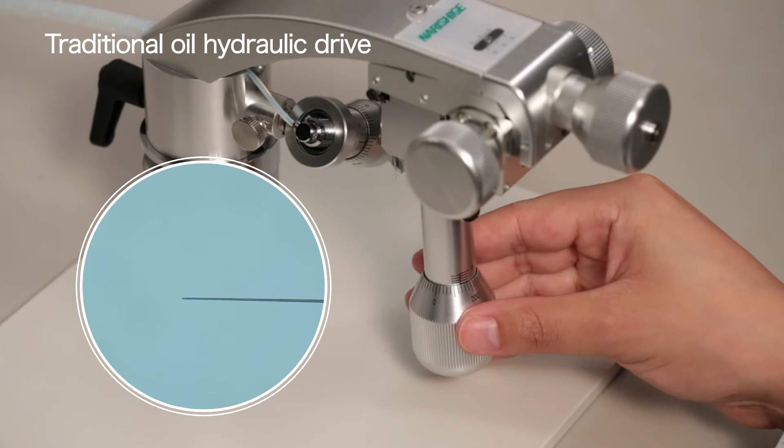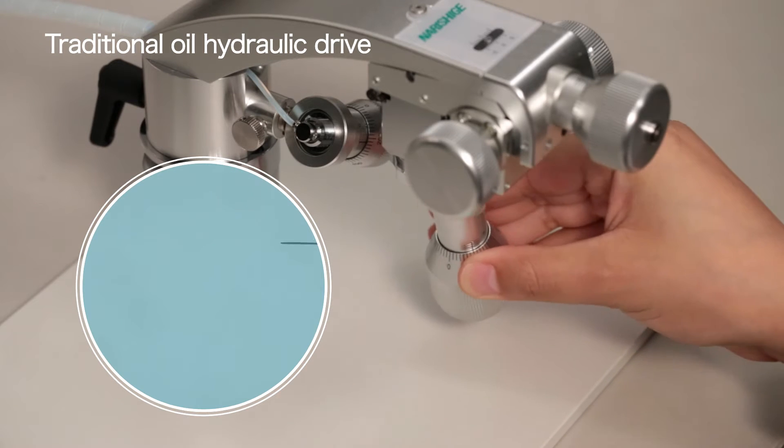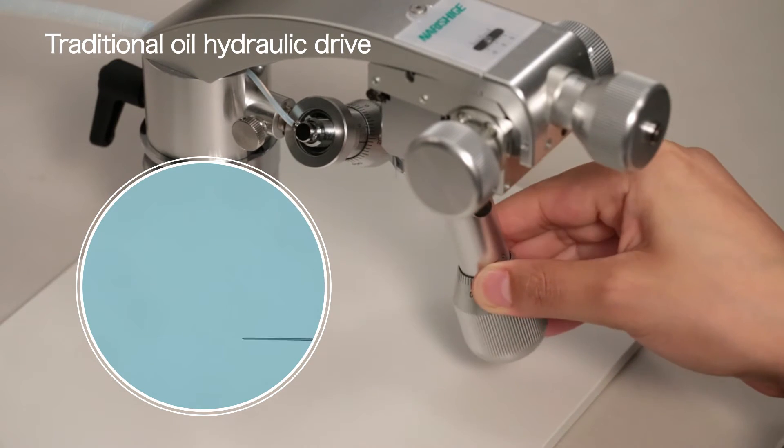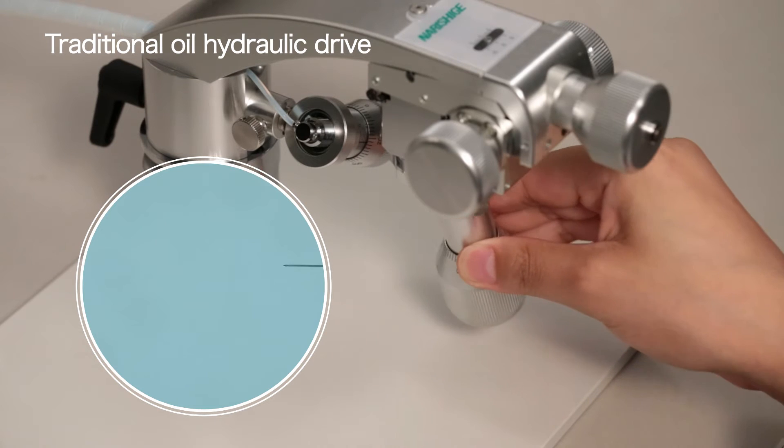Smooth, precise response of the three-dimensional joystick enables operators to pick up moving objects with confidence.